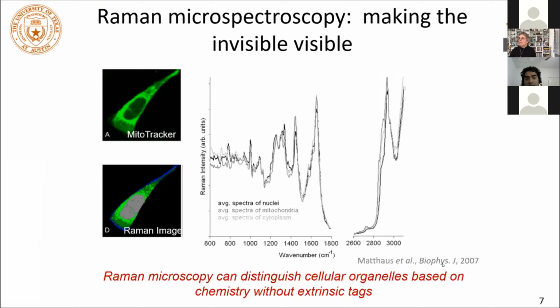The groups from astronomy and mass spec have been using unsupervised, arguably really straightforward methods like principal component analysis or cluster analysis to do a lot of similar processing, but on hyperspectral data sets like this. And they've been doing that for years. And so the people in the Raman community really just ported those tools to their data and were able to apply them.